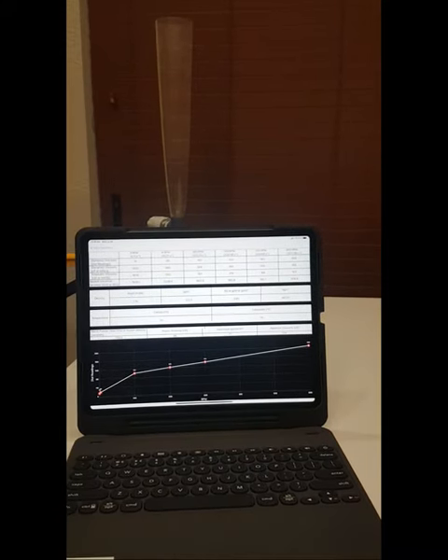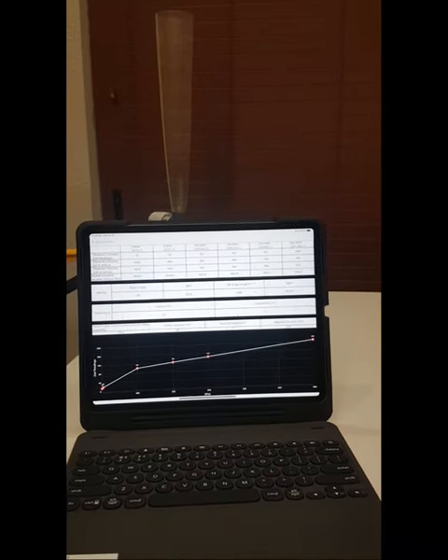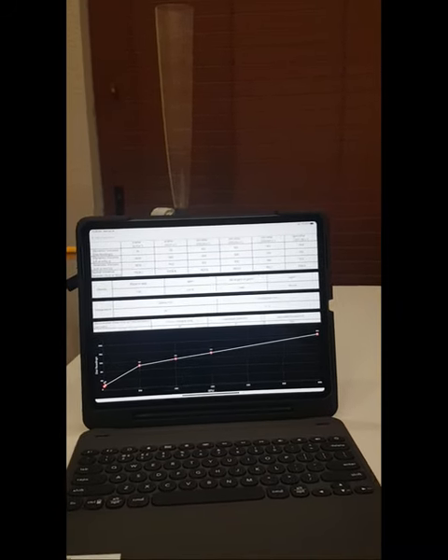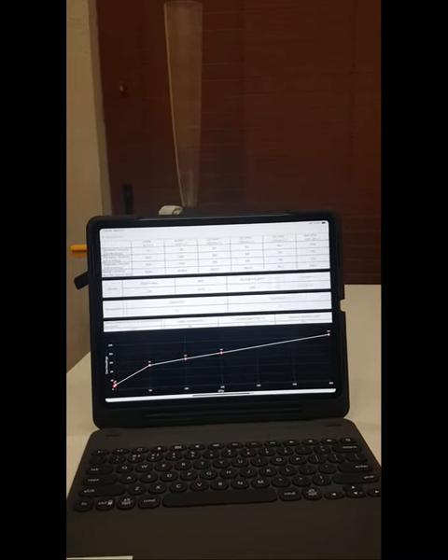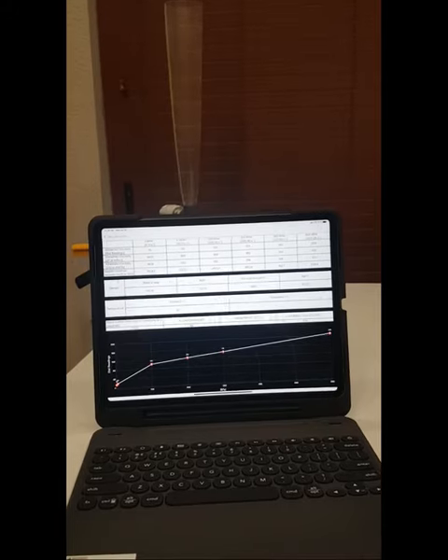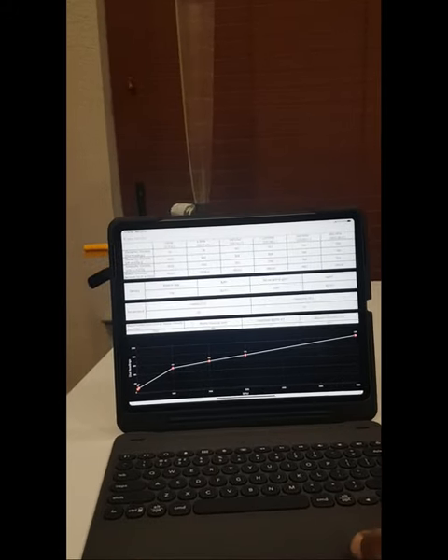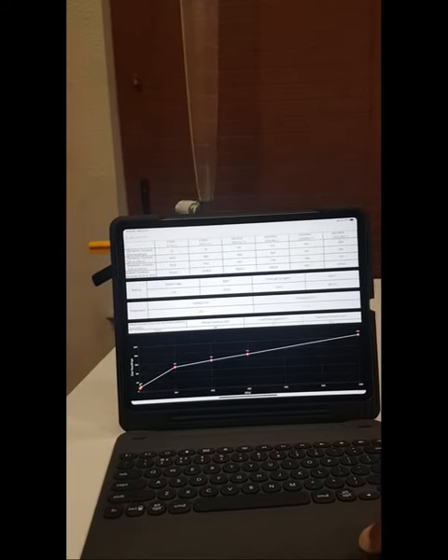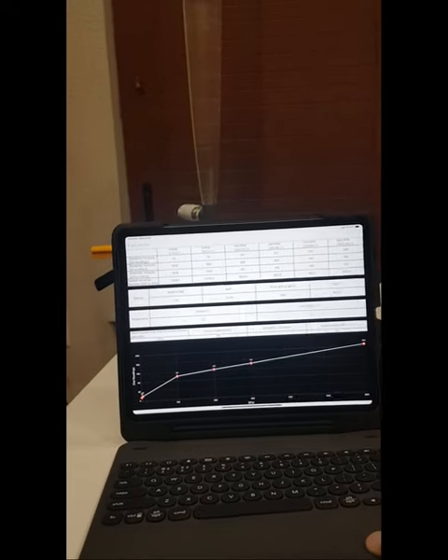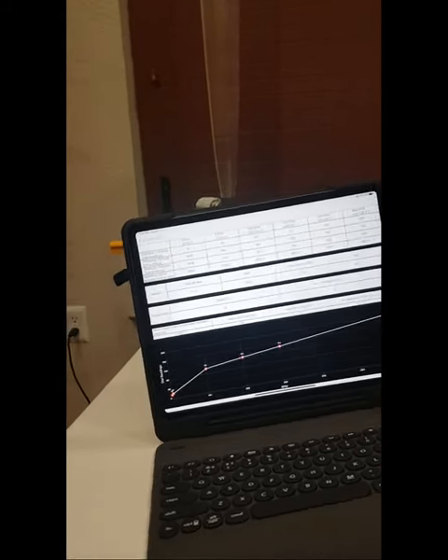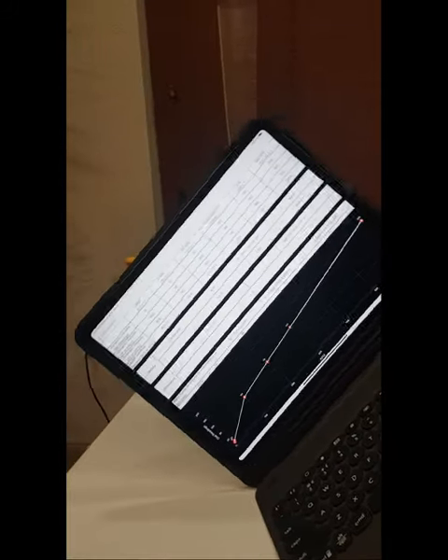The device can also be used to measure the gel strength at the desired time interval. The data can be transmitted easily to a designated data acquisition system.